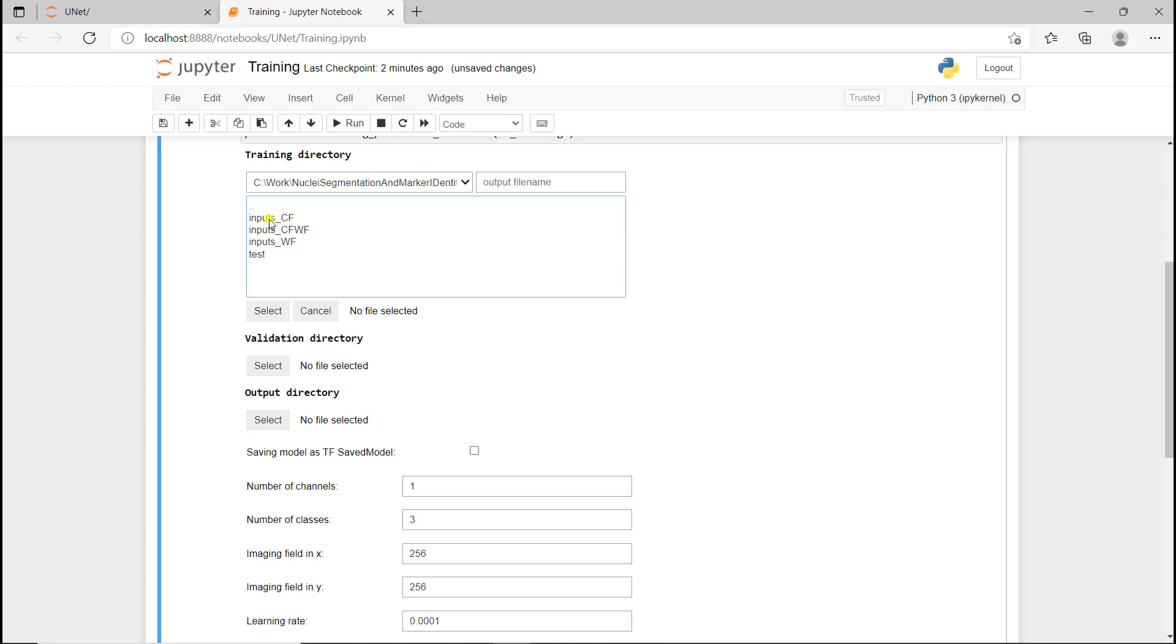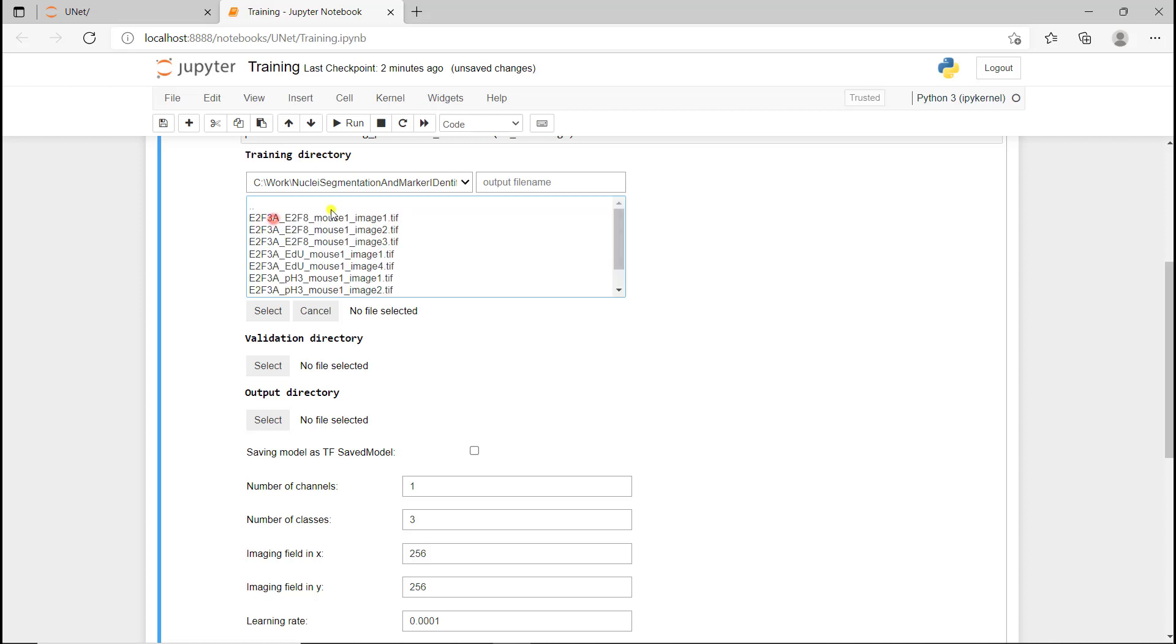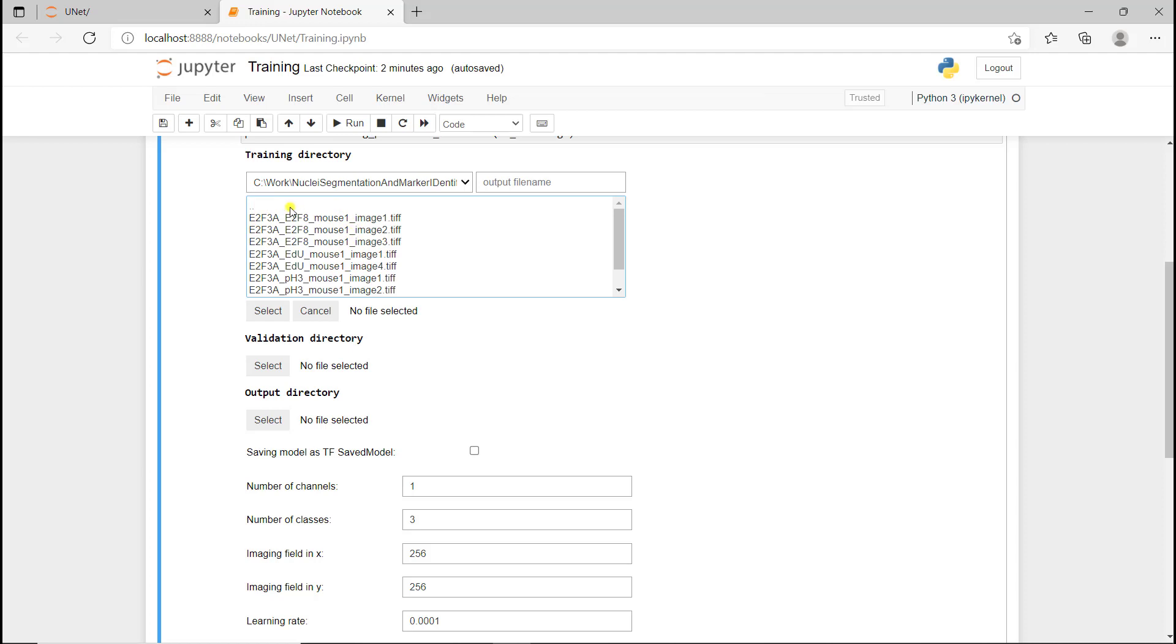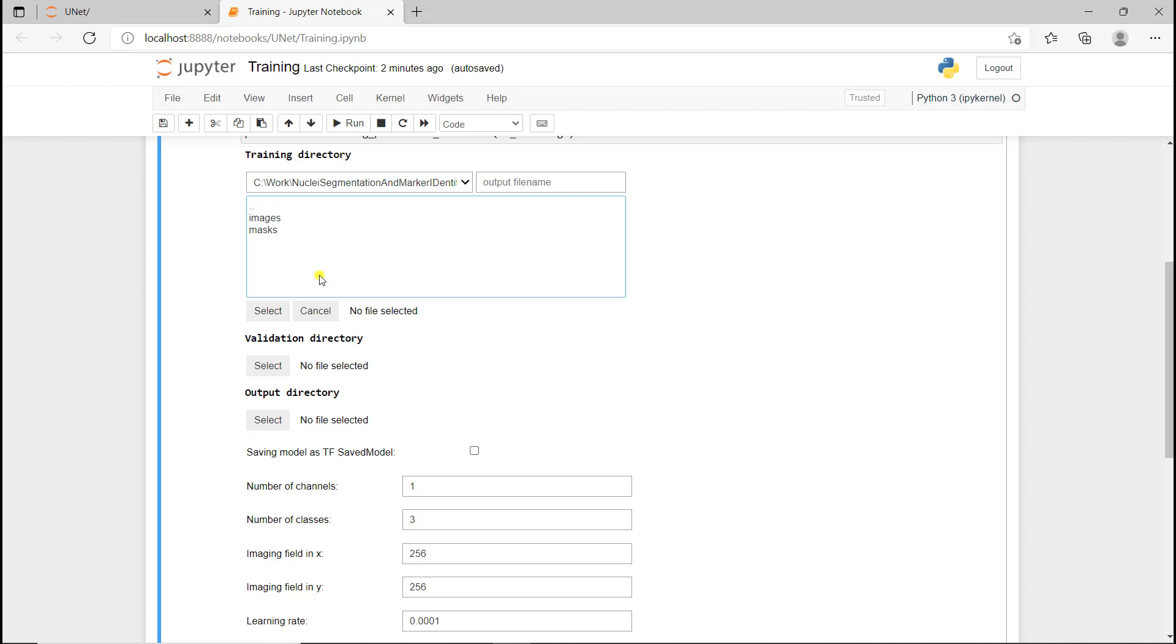I'm going to click on input CF, and then I have the training and validation folders. If I click on training, I have two folders: one for images and one for masks. If I go into images, I have all the confocal images, and if I go into masks, I have the corresponding masks with the same name, so the algorithm knows which segmentation mask corresponds to which image. I'm going to select this folder.